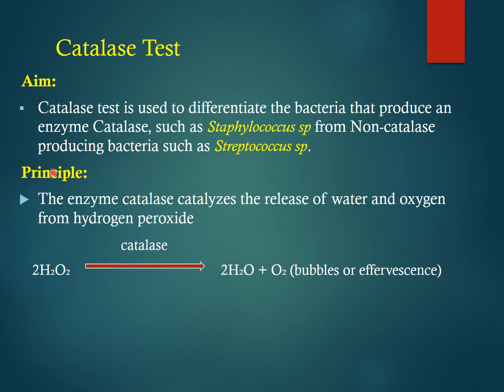It is based on the principle that the enzyme catalase catalyzes the release of water and oxygen from hydrogen peroxide. If you see in this reaction, this catalase enzyme reacts with hydrogen peroxide to form water and oxygen, which results in bubble formation.